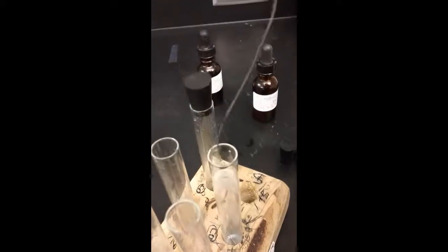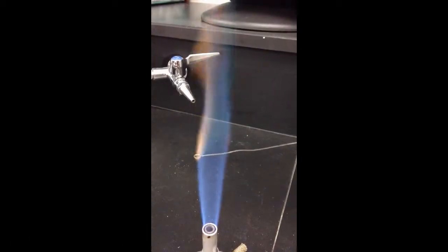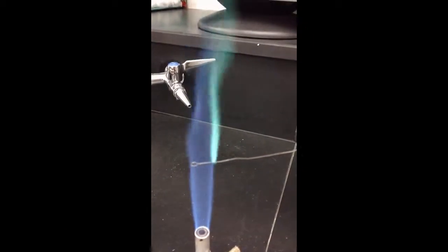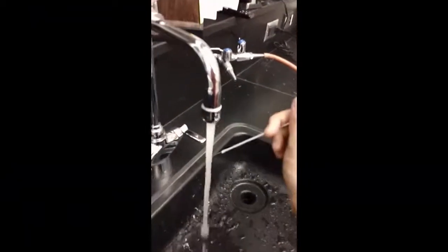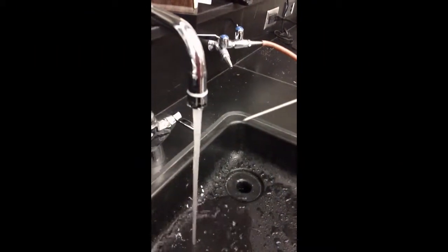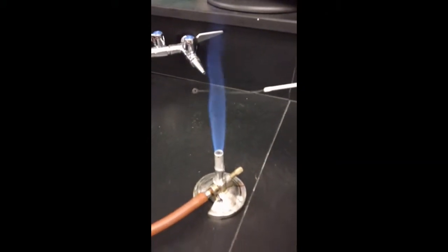Put it in there. Do it one more time here. Okay, make sure you're writing down your observations. That was CU test A. Rinse one more time. Our very last one is K. So we have our potassium.